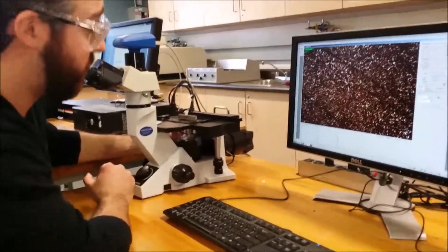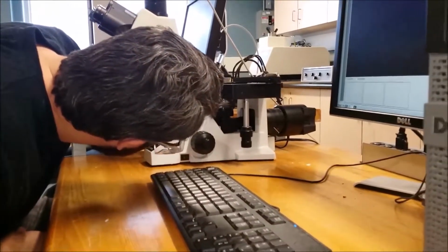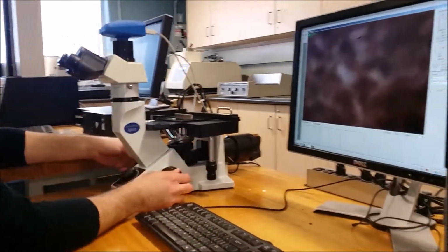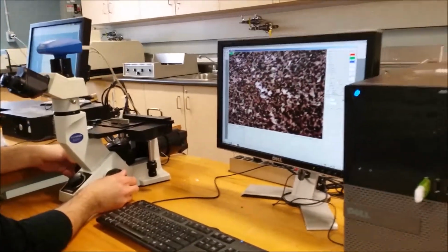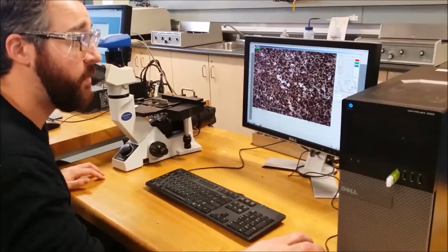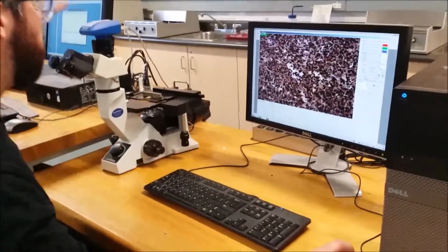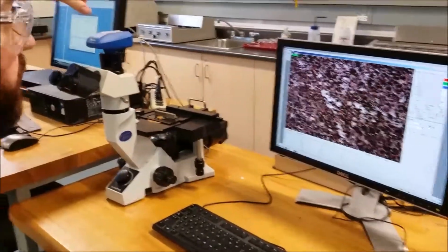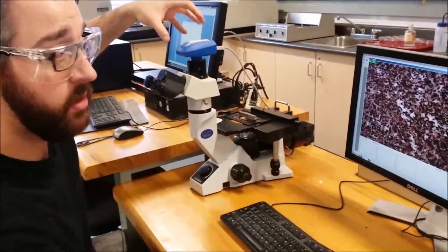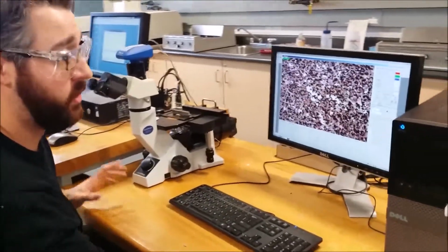Now, let's bump this up to times 50. We're going to focus in. Beautiful. Over here, we have an exposure control. What this does is lets more light into the lens. This right here is our camera. Basically, it's a digital exposure, so it opens and closes the lens on here. A little brighter, a little darker.